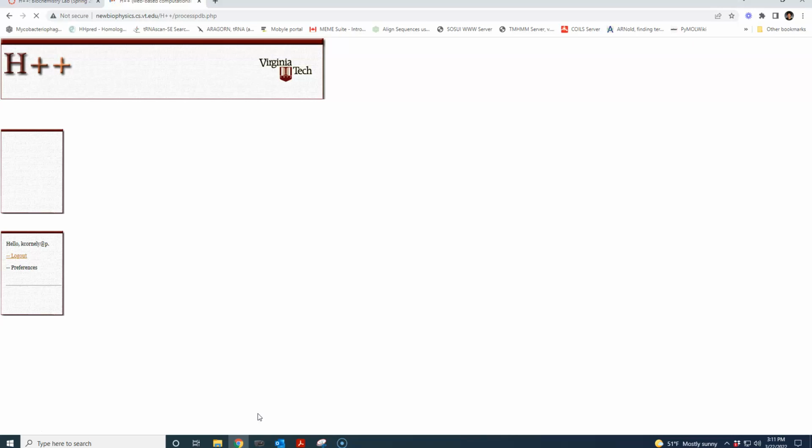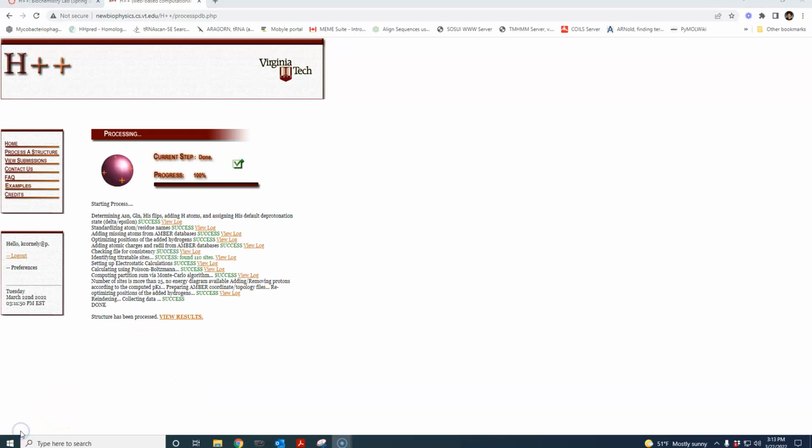Usually I don't get a blank screen. I think what I'm going to do is pause this and then just come back when I get my results. Okay, so I paused the recording and now I'm back. It didn't actually take that long, maybe just a few minutes.